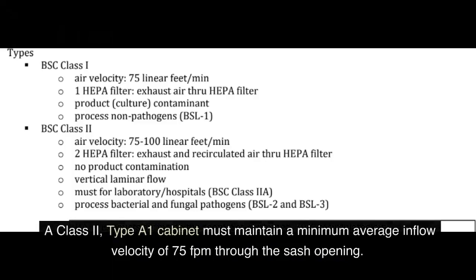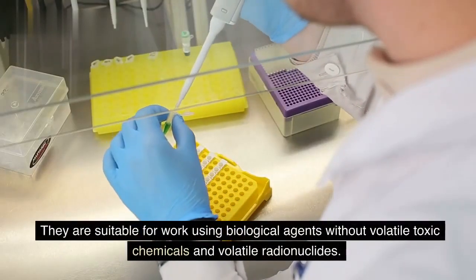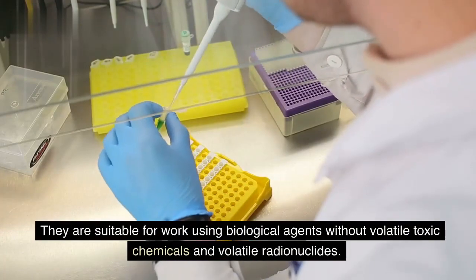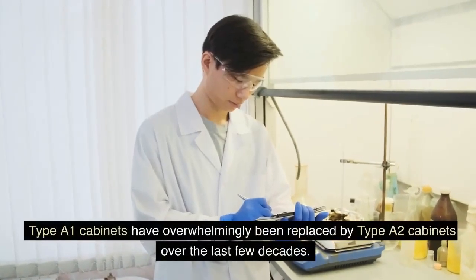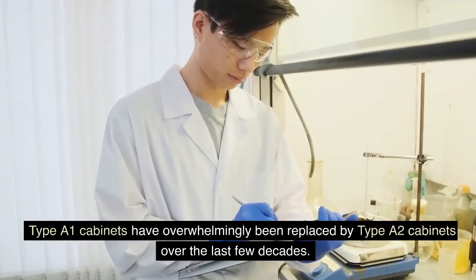Type A1 and Type A2 biosafety cabinet. A Class 2, Type A1 cabinet must maintain a minimum average inflow velocity of 75 fpm through the sash opening. They may exhaust HEPA-filtered air back into the lab or may exhaust outside using a canopy connection. They are suitable for work using biological agents without volatile toxic chemicals and volatile radionuclides. Type A1 cabinets have overwhelmingly been replaced by Type A2 cabinets over the last few decades.